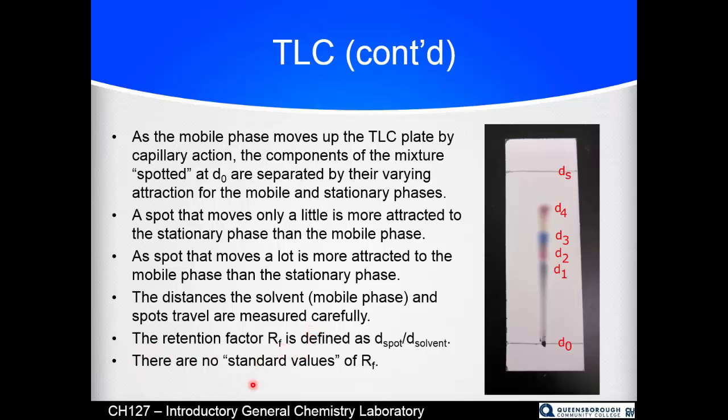Just a quick note that there are no standard values of Rf. You can run your unknown and run a known right next to it and see if they happen to have exactly the same Rf. That's, again, a data point that they are likely to be the same thing. Certainly, if they had different Rfs, they would not be the same thing. But you can't absolutely confirm it, and nor could you go to a book and say, oh, the Rf of this component is this high. That would not be the case. It depends on the solvent, it depends on the stationary phase, it depends on a variety of factors.